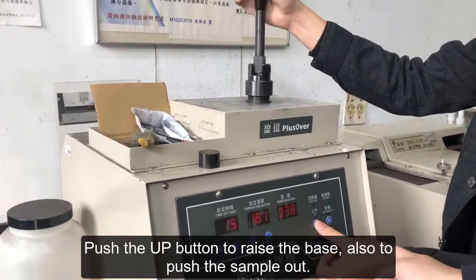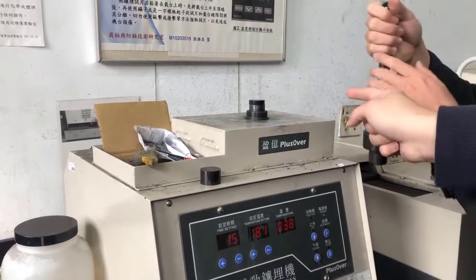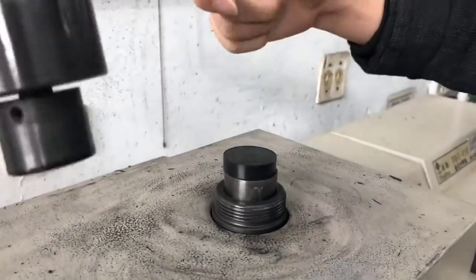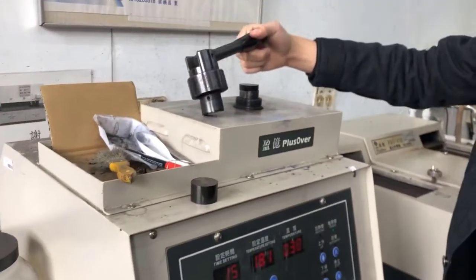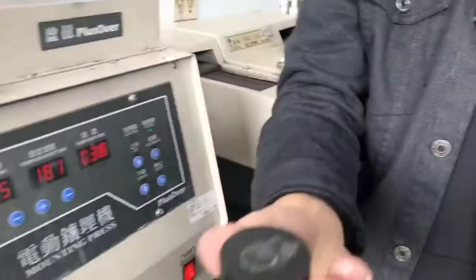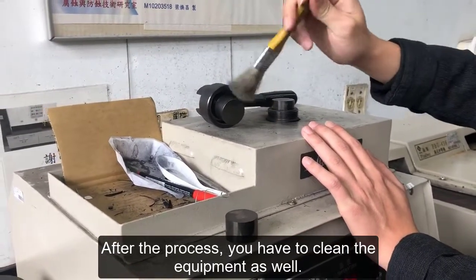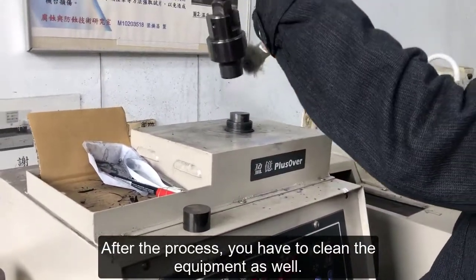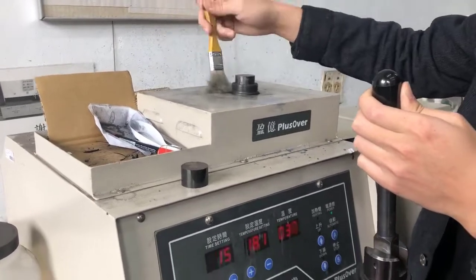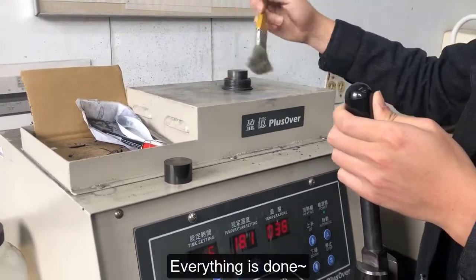Push the up button to raise the base and also to push the sample out. Your sample is done. After the process you have to clean the equipment as well. Everything is done.